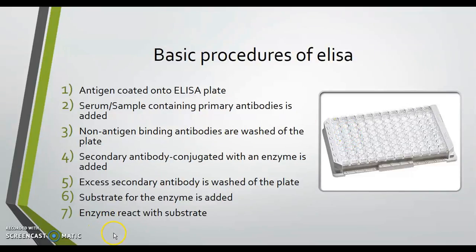And later, the secondary antibody, which is linked by an enzyme, is added to the sample. When it is added, the wash buffer is also added in order to wash and flush off the secondary antibodies that are not bound to the primary antibodies to form a complex.